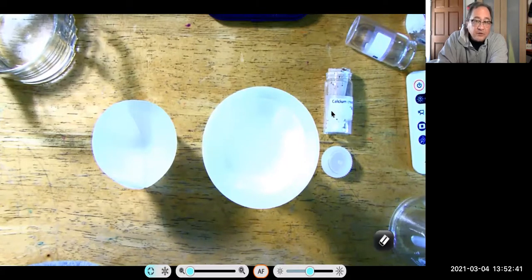This is different than the clothes in your dryer, which we're trying to dry. How do you know the clothes in your dryer are dry? Well, the answer is you just feel them because you're okay with them feeling dry and assuming they're dry. But the real way to determine if your clothes are really dry would be to dry them, let them cool, pull them out of the dryer and weigh them, put them back in the dryer, dry them, let them cool, and weigh them again. If the weight doesn't change, they were dry, because the only thing that should be leaving your clothes would be water.